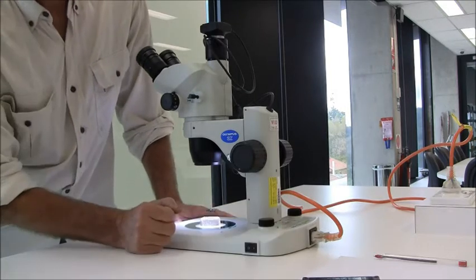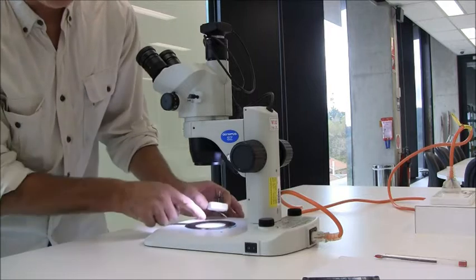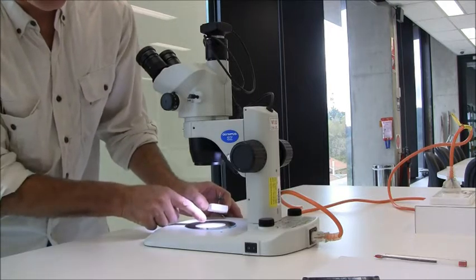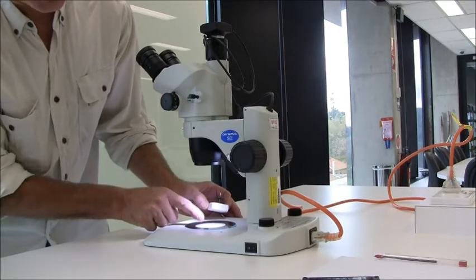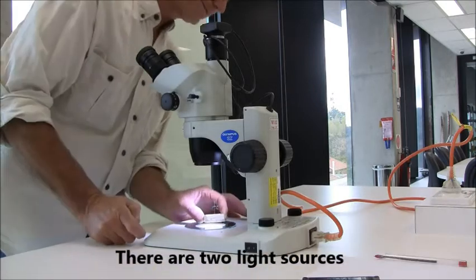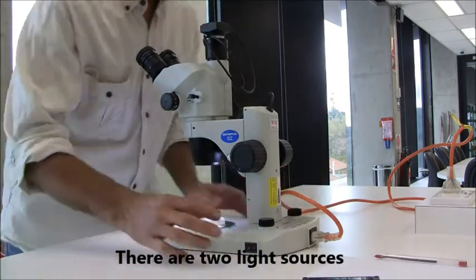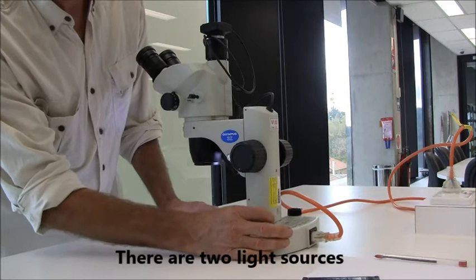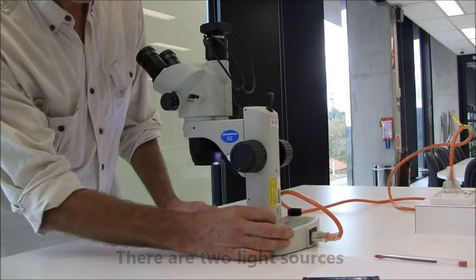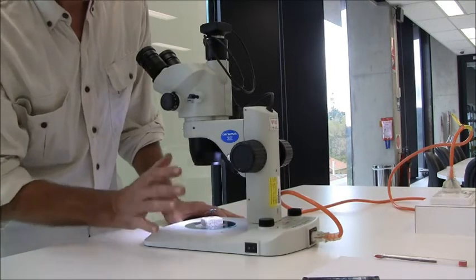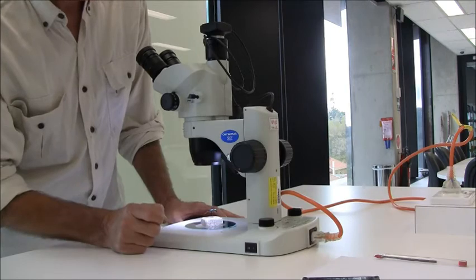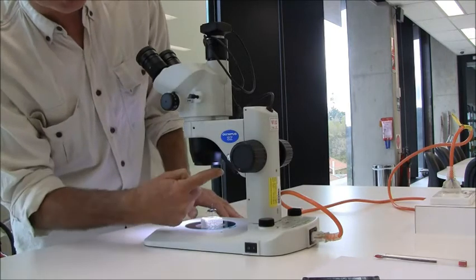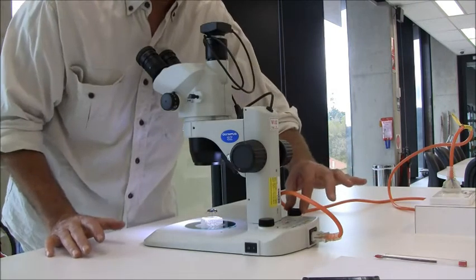But you can direct the light from two different paths from below the specimen. And that is the light intensity dial on the right. And so you can work with fairly thin and small specimens. Or you can direct the light from the top, and that's the dial on the left.